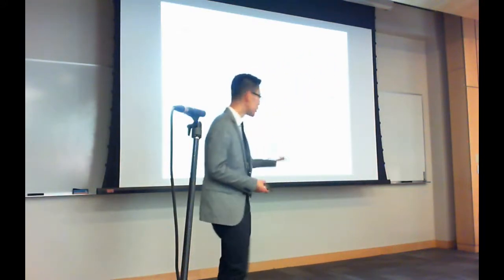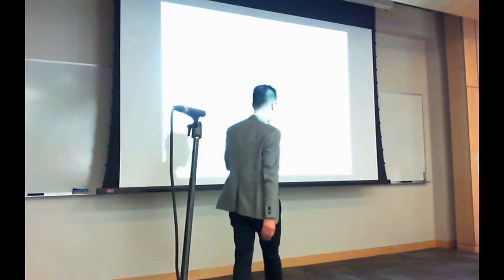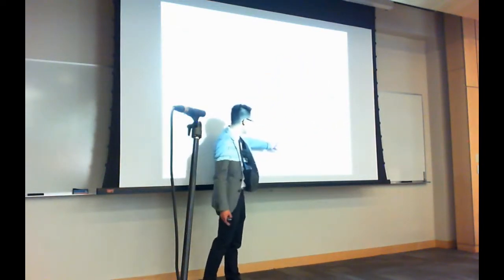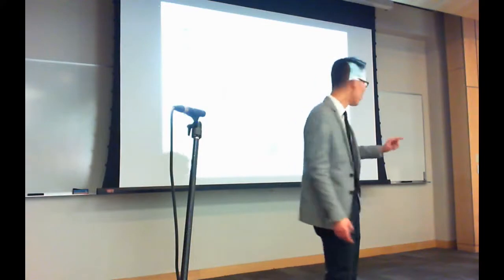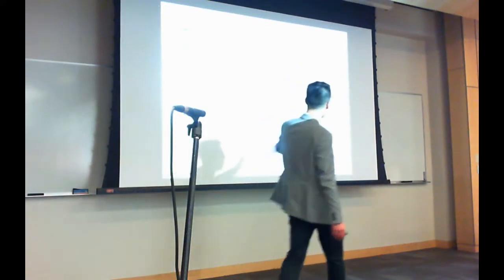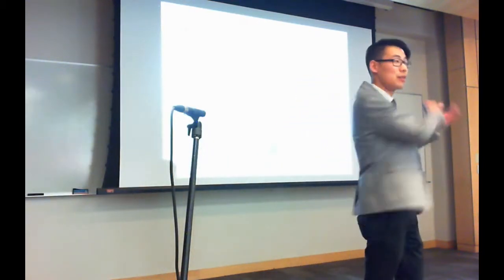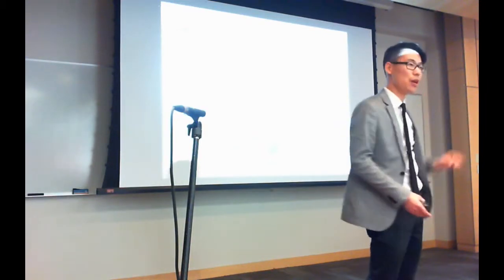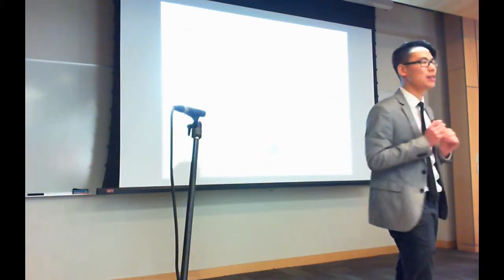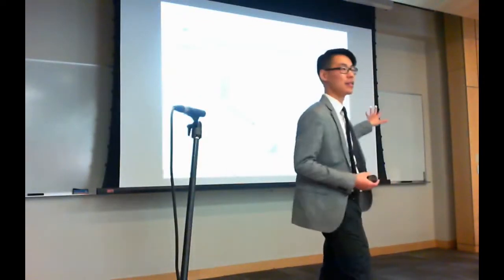And what we can do is rescore a spectrum match between a query and a library. If we have a score T here, it's simply the integration to the left of this point. From the specific example that we saw earlier, where it was just one big peak, it has a cosine of 0.8. We know that this very intense peak shouldn't vary very much because it's very intense. And so we would expect all the replicates of the library spectrum up here on the right to have a very high similarity to the library spectrum. And then when we rescore it with this SLGF distribution, we find it has a score of 0, and we don't believe it.